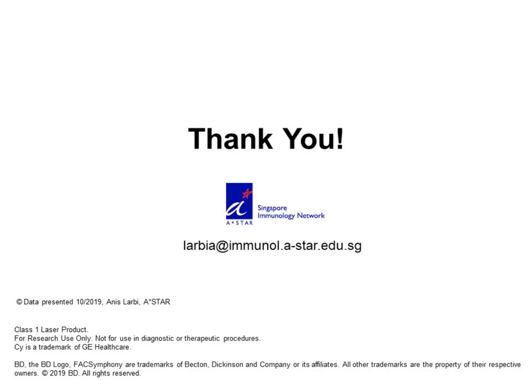There are a lot of viability dyes available now, and some of them have fluorescence that is also preserved after fixation. These are the protein binding dyes.